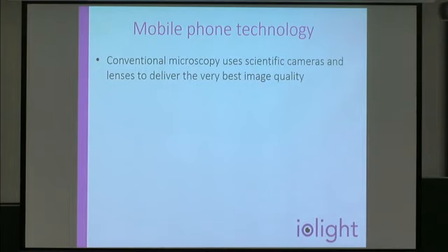The conventional microscopes use what are called scientific cameras and lenses, and they're fabulous. They deliver superb image quality. Problem is they're large, expensive, and power hungry, and not really suited to a lot of the applications that you find outside of conventional laboratories.